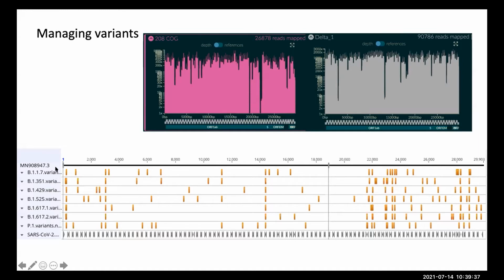So we took all of these genomes as an input data source, and then made a new scheme, which is now called V4, which we're currently rolling out. And this is actually old data, but it's the only one that I had to hand, showing V4 primers and how they've addressed these dropout regions for a Delta variant. You can see that across the spike, we have complete coverage over 20x.